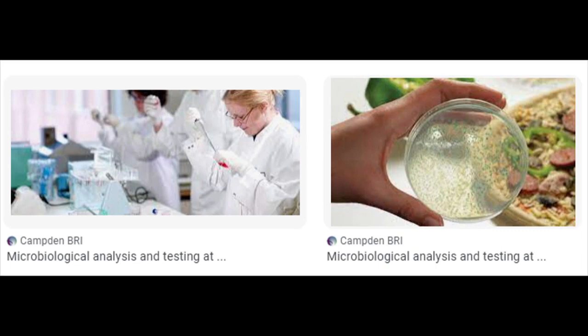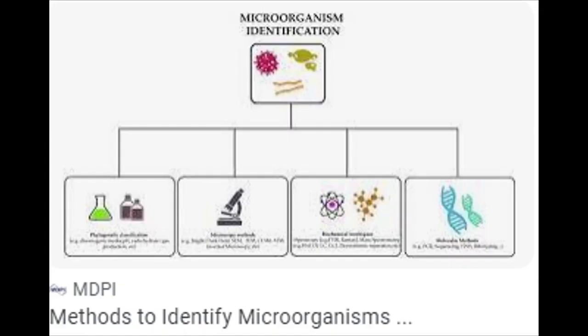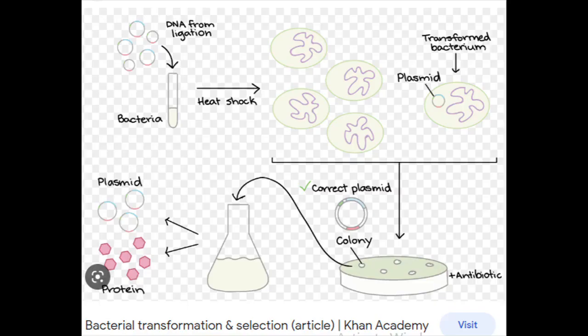I said, although there is clearly a place for the direct examination of a food for microorganisms, a full microbiological examination usually requires that individual viable groups are encouraged to multiply in liquid media, or on the surface or within the matrix of a medium solidified with agar.